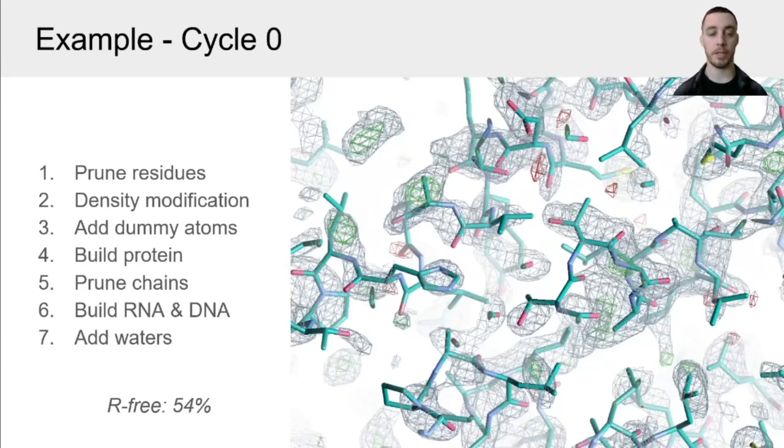Now, Molrep managed to place 3 copies correctly, but one of the copies was placed incorrectly, and what we're looking at here is a view of the incorrectly placed copy. So the density for this isn't very good, and the R free for this overall model is 54%. And it's stuck at that. So it was 54% after Molrep, and after refining with Sheetbend and RefMac, it's still 54%. It hasn't managed to improve the model very much.